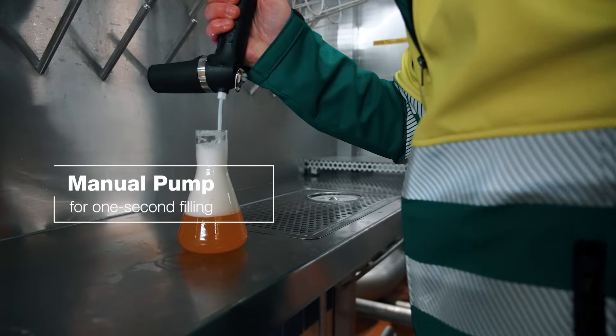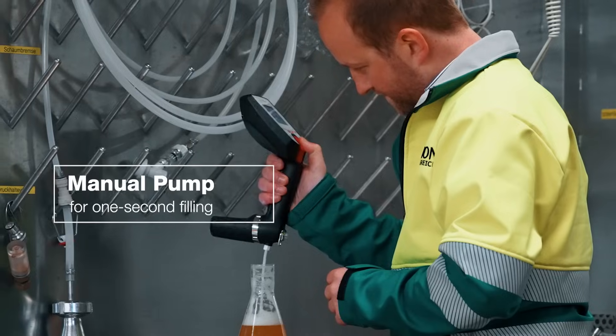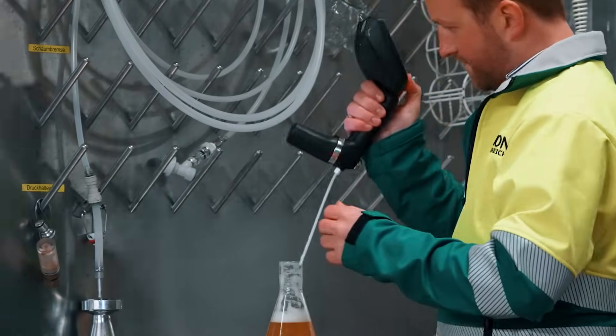Fill samples in seconds with its manual hand pump and avoid down times thanks to a replaceable measuring cell.